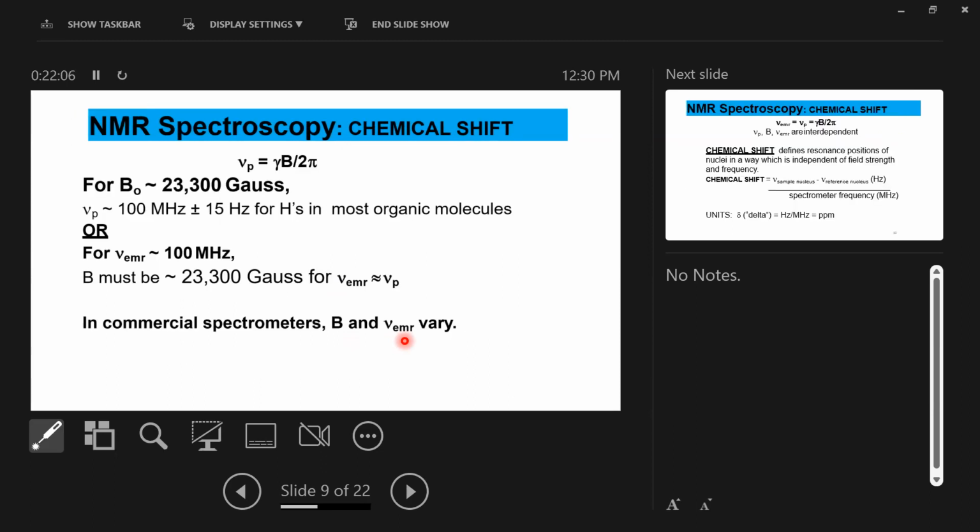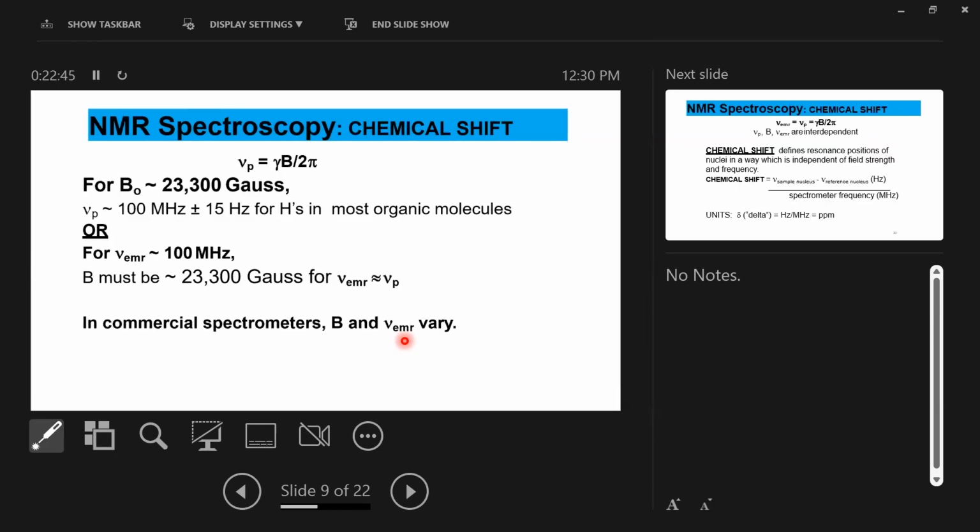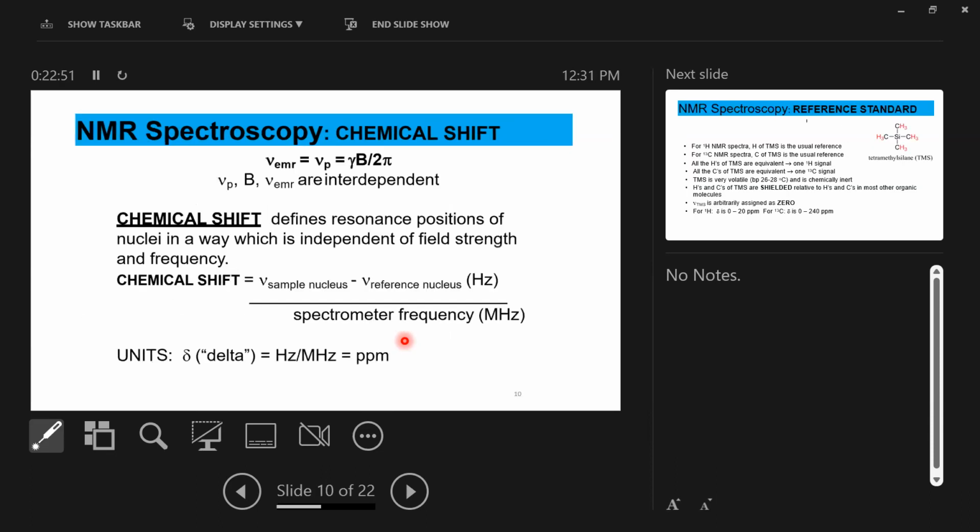So why would you? You want it to be something called resonance, meaning that when it's exposed to the magnetic field, it aligns and rotates. So if it's like this, it spins. You guys didn't watch the video. Watch the video and go home. It flips the molecule on its head from being upward to slightly like this. And in that rotation, it generates a current. That's called resonance. Watch the video. Yeah, but I went through this last class. It's in the video the same way as I sent it.